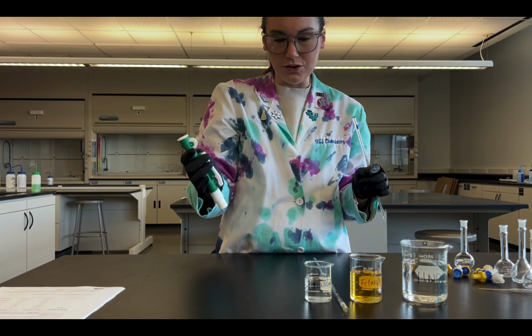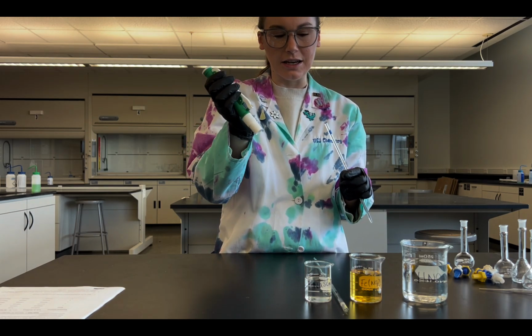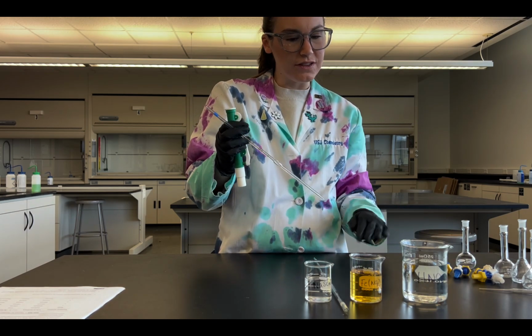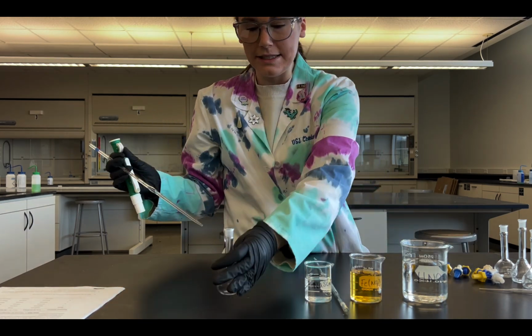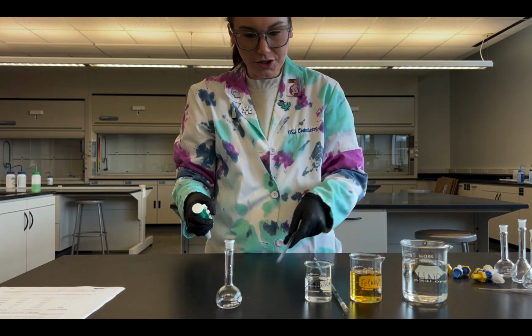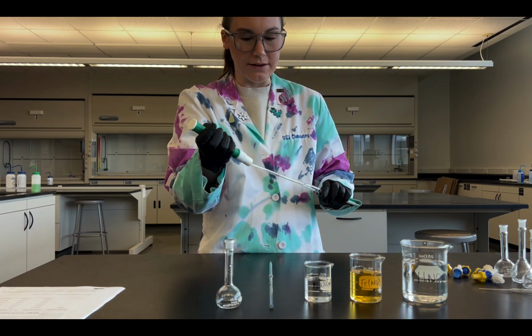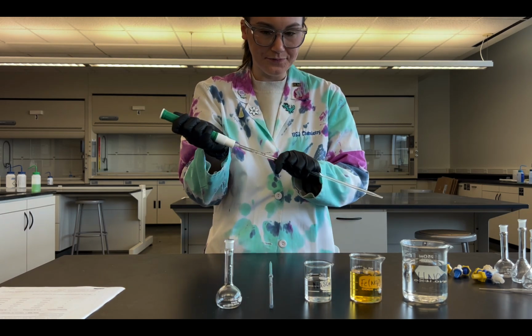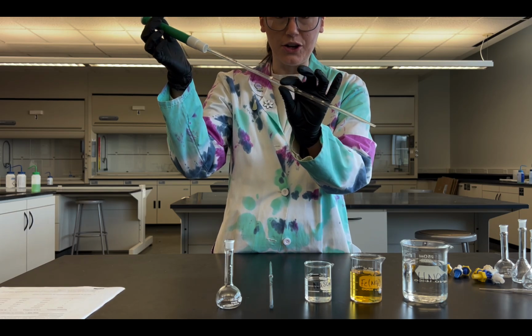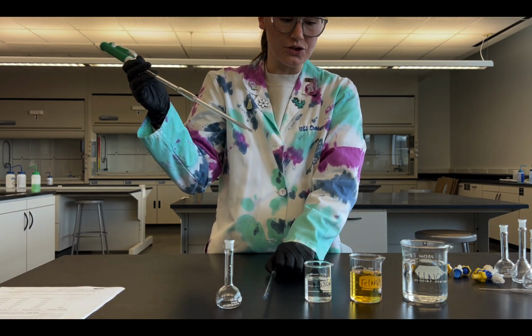So what I'm going to do is use my pump here. This essentially is what's going to suck up the liquid, and I'm going to add my specific volumes of each of these into my 6 volumetric flasks. I'm going to start with my iron nitrate because that's my constant volume in each of these. So this is a 5 milliliter volumetric pipette. I'm going to do this twice into this first one.